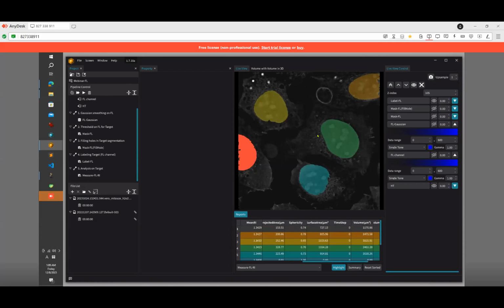That's right. And also it glitches. Actually, for that one, we don't have any good starting points because it depends on the sample very much. So it should be your experience about how to control these spacings for the fluorescence measurements.